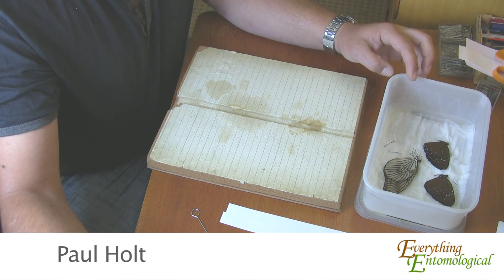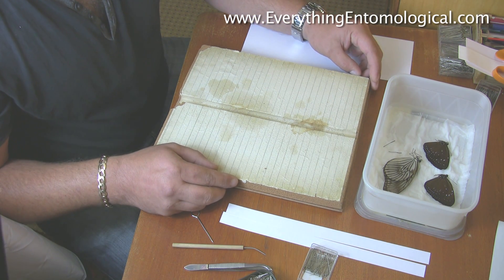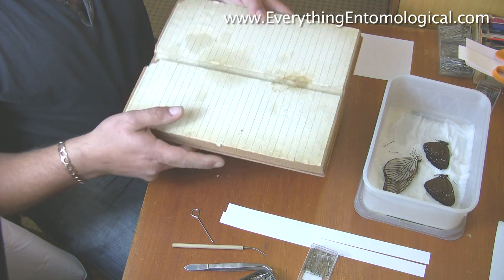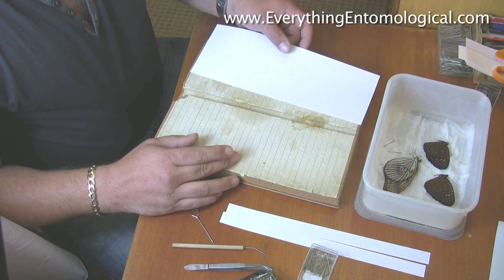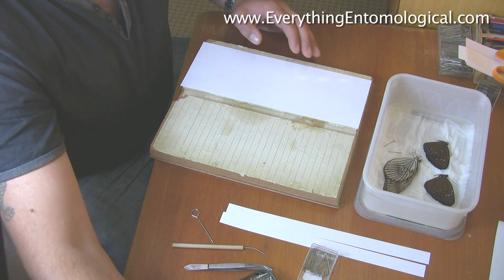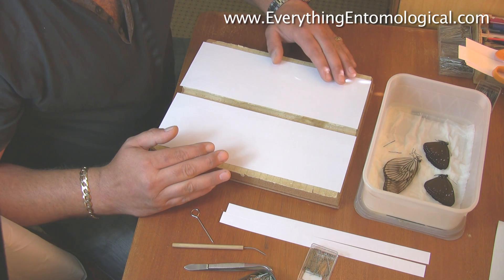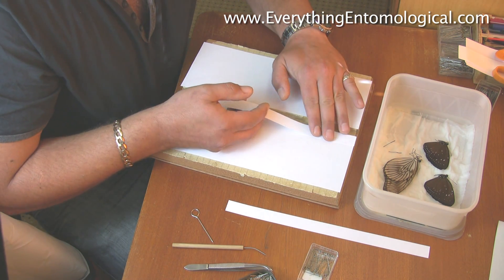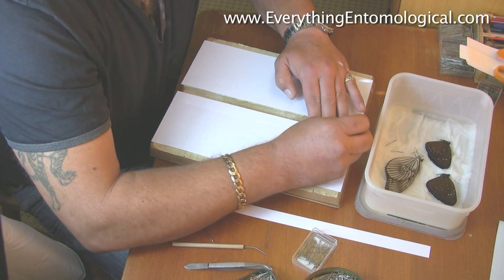Today we're going to mount some specimens — two different species. I'll give you a rundown on how we actually set the board up. It's just a normal cork board, as you can see, with various holes from previous use. What I tend to do is line the board with normal A4 paper on both sides — you can cut this with scissors or a guillotine. I use a guillotine. We layer the board like this, leaving a groove for the body, and these I call setting strips — also A4, just chopped down — and we pin them into place.